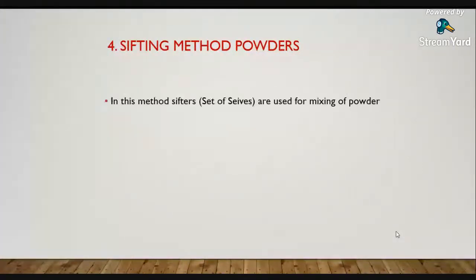In the sifting method of powder mixing, sifters are used. Now what is a sifter? Sifters are a set of sieves that are arranged by their mesh size.